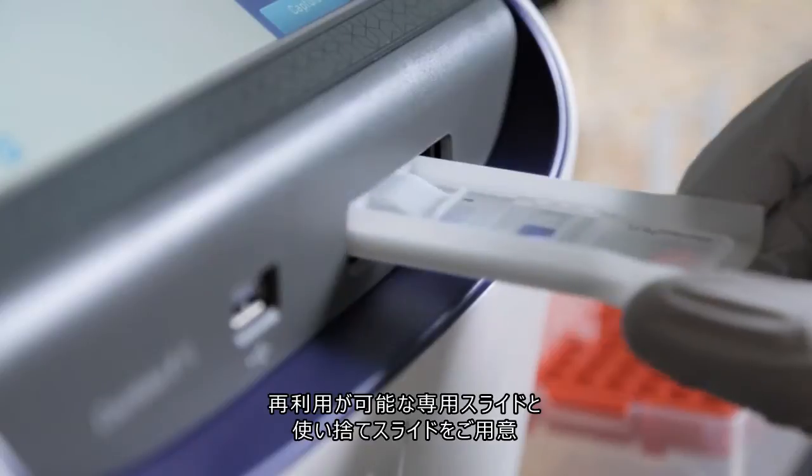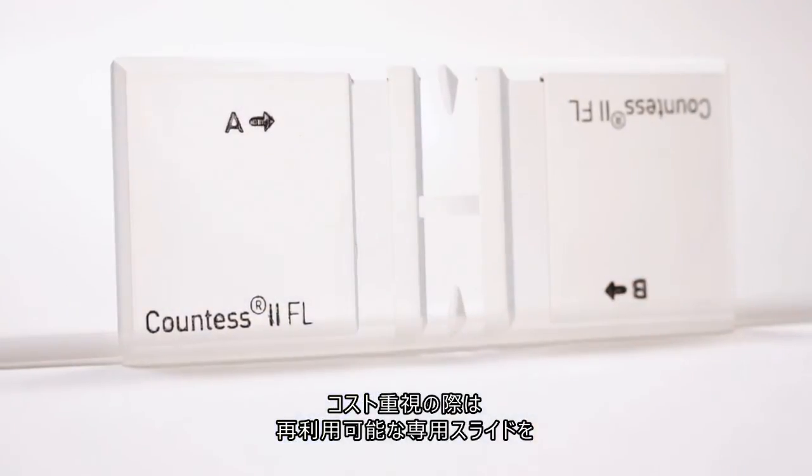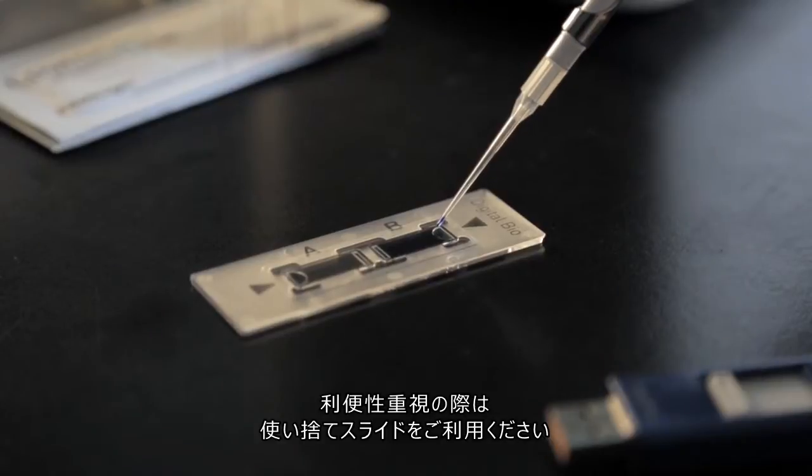The unique design of the Countess2 FL automated cell counter allows the use of an optional reusable counting slide to help reduce lab consumable costs. Disposable slides can also be used for added convenience and easy cleanup.